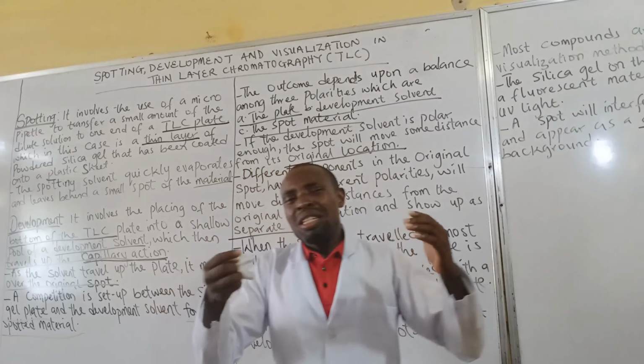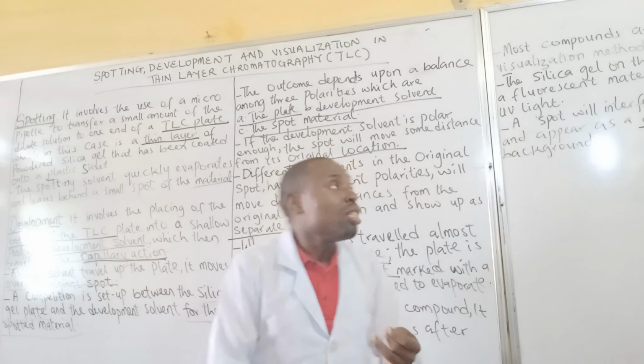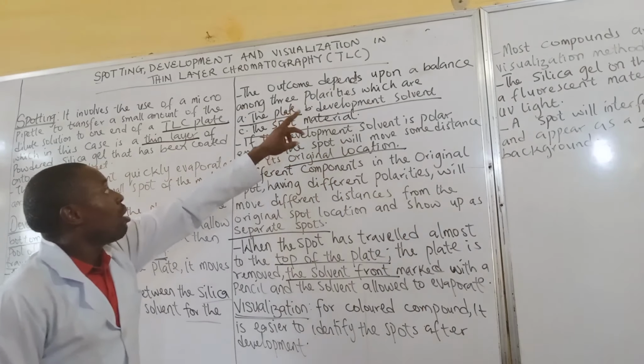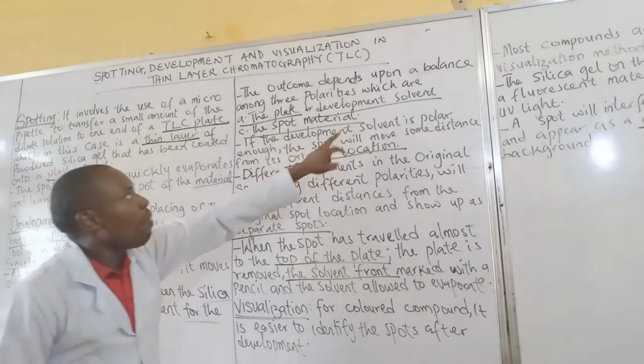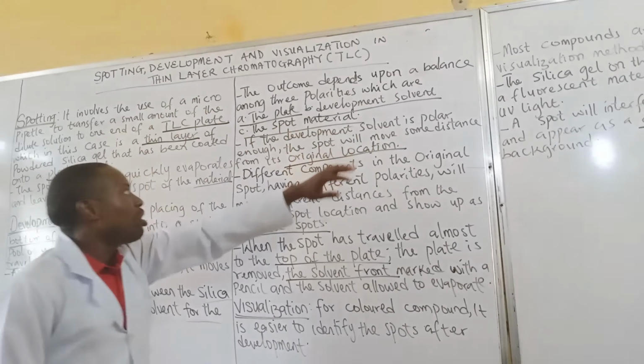And it depends on three polarities, which are one, the polarity of the plate, the polarity of the development solvent, and the polarity of the spot material.